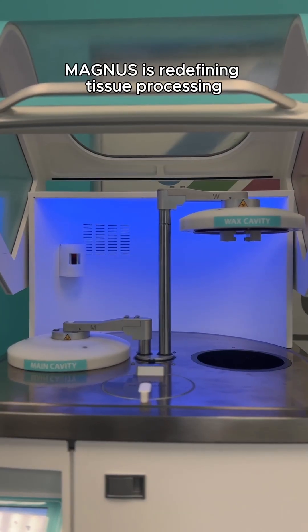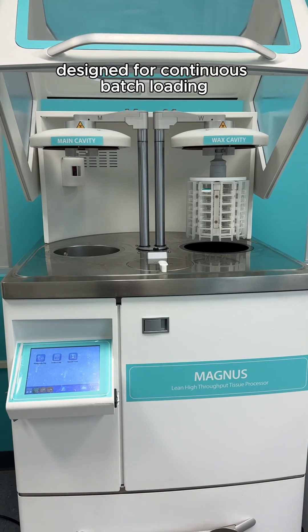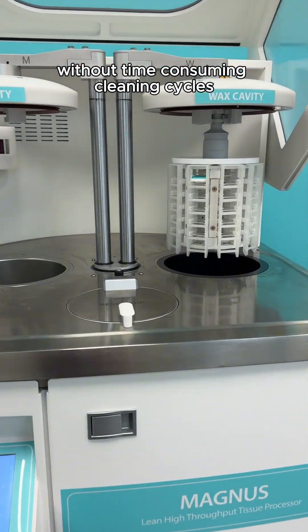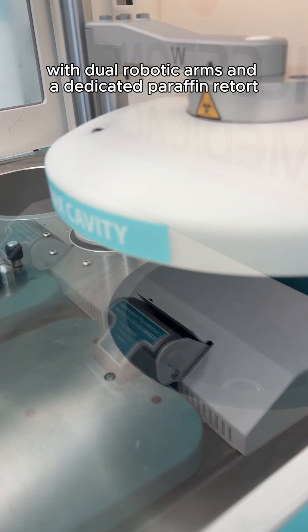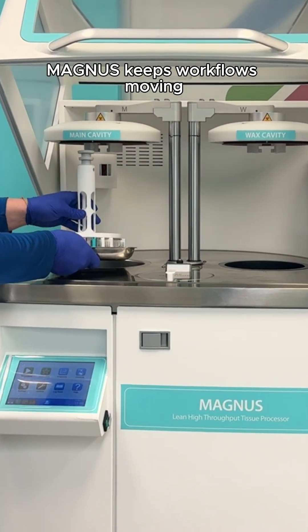Magnus is redefining tissue processing with an innovative dual retort system designed for continuous batch loading without time-consuming cleaning cycles. With dual robotic arms and a dedicated paraffin retort, Magnus keeps workflows moving.